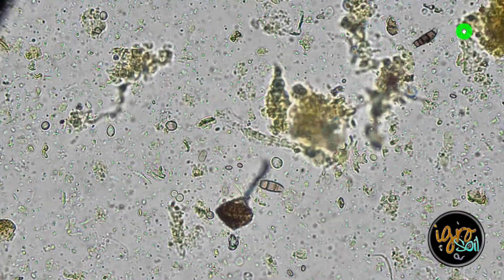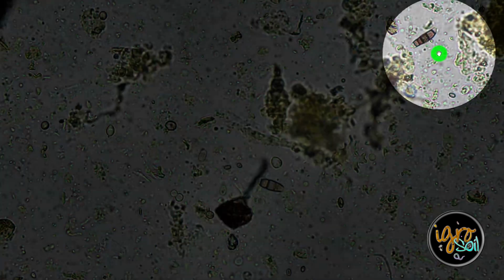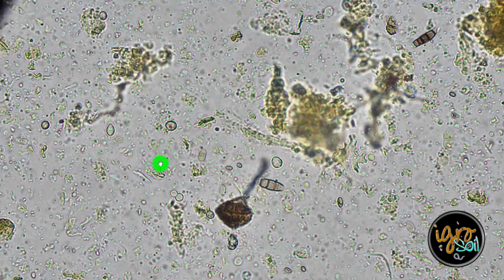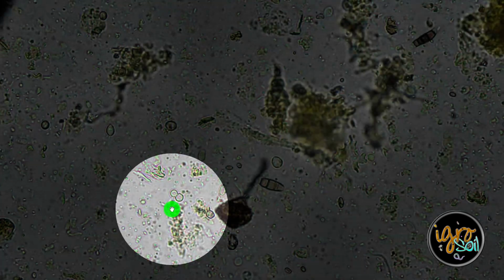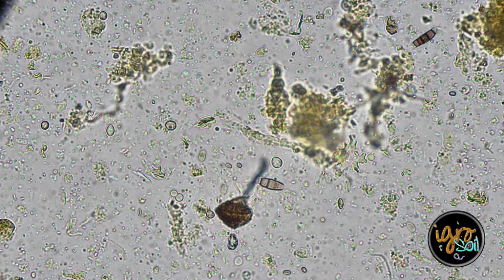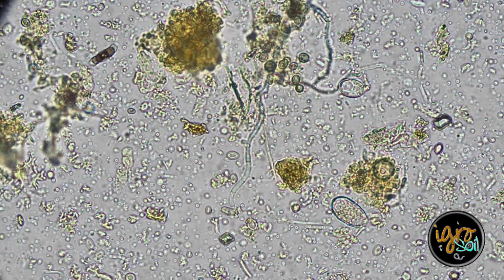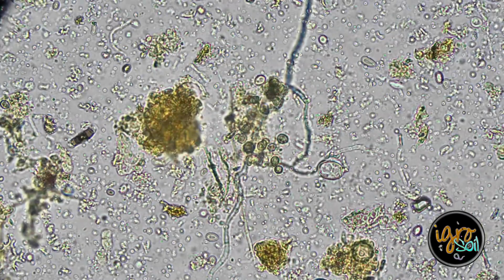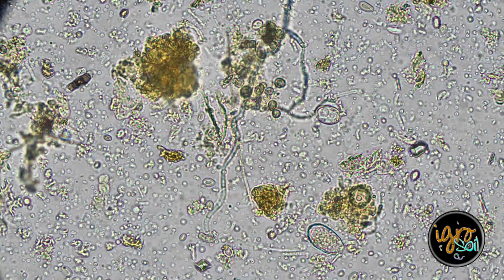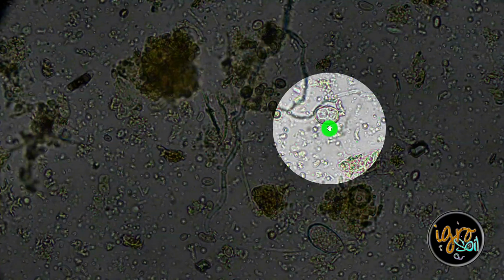There's spores, a spore there, and a spore there. That's potentially a spore. These are all potential spores, to be honest with you. That looks like it's budding, so that might be some type of yeast. So there's a lot of beneficial things already that I'm looking at here. I mean, I just turned this thing on. I never position anything. I turn it on and I jump on the camera. Oh, wrong button. Here.